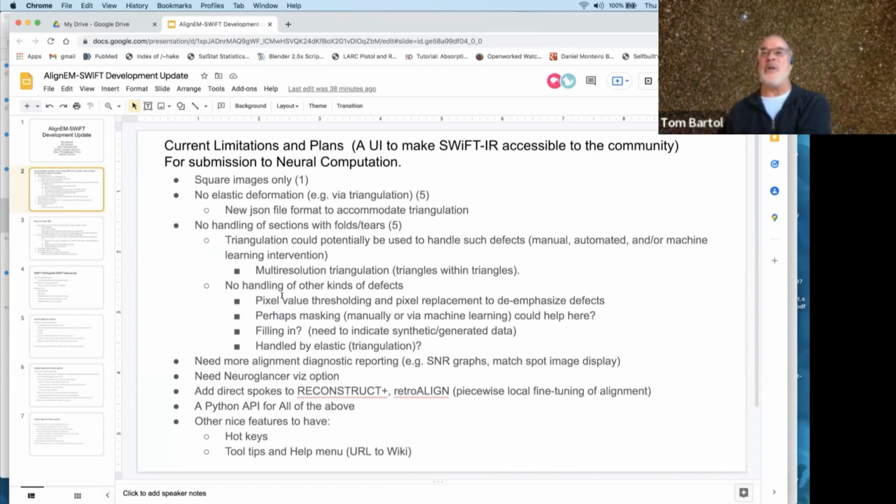And then the result we have to put back in the ZAR container so that we can see it, right? But in discussion yesterday, Art was already thinking, that's clunky. There's got to be another way to go about it, and Art already knows what he's going to do about it. He's going to make a new version of SWiM, or add to the features of SWiM, so that SWiM can look inside the ZAR and get the chunks of data out of the ZAR and, in memory, put the image back together again.